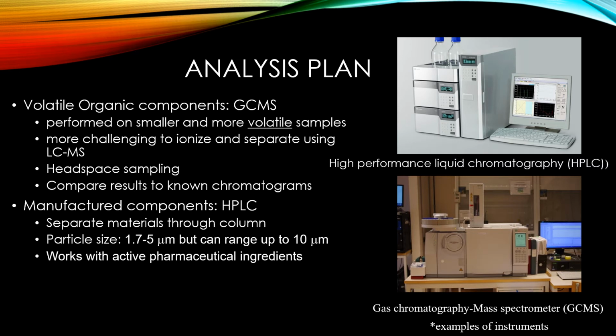We would also be using headspace sampling to detect these volatile samples, because some of the samples on that list would vaporize very fast and would not be detected if just inserted into the machine, as well as it can ruin any other detections later on. And at the end, we would like to compare the results to known chromatograms to determine what truly is in this soil sample.